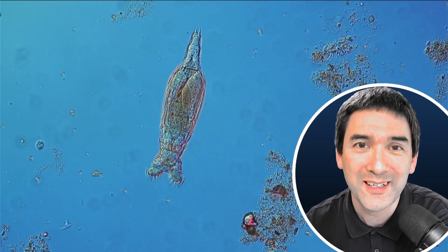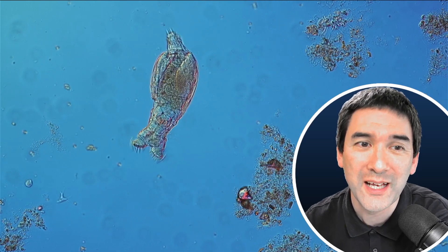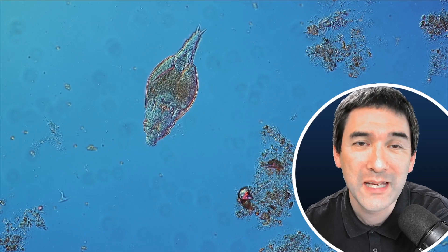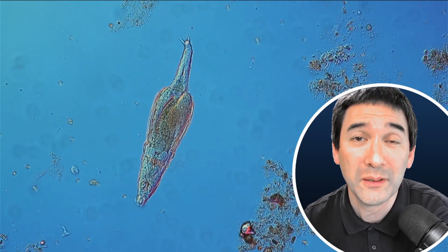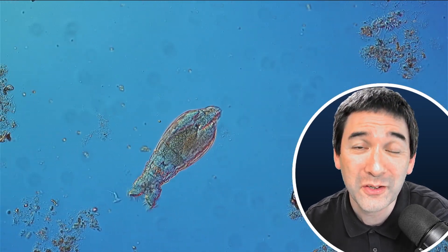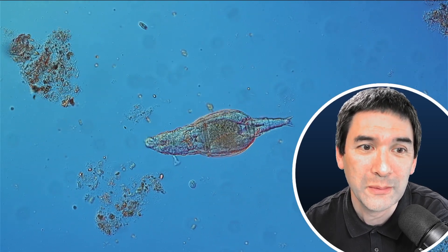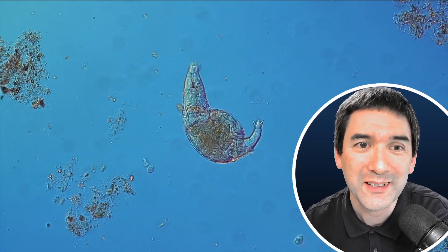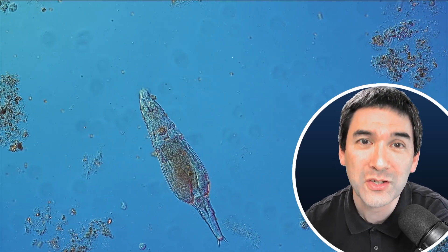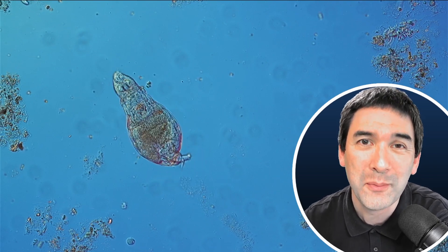Occasionally you can see again how it extends those cilia, those tiny little hairs. This way it's able to generate a water movement, and it's able to suck up detritus and other particles, bacteria, decomposing matter, and use them as a food source. Let's keep following it along. You can also see that it quickly retracts its ring of cilia when it touches something — that's a form of protection, maybe. I'm going to increase the magnification a little so we can get a closer look.